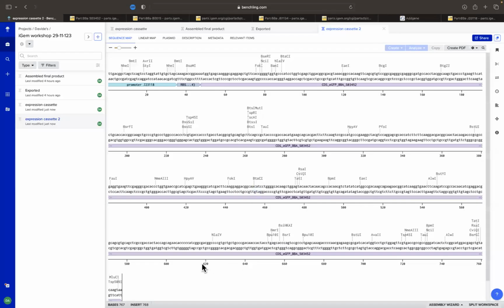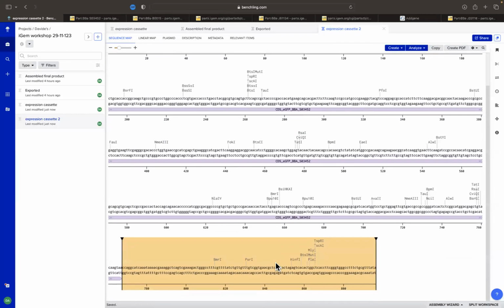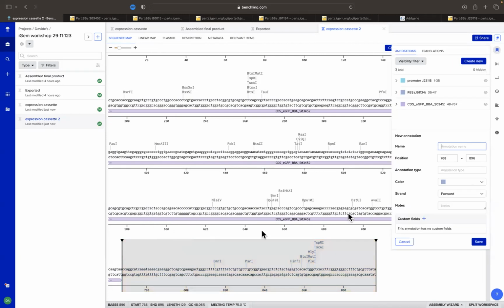We copy this one. We go back to our expression cassette, and we paste it. And then we just call it.